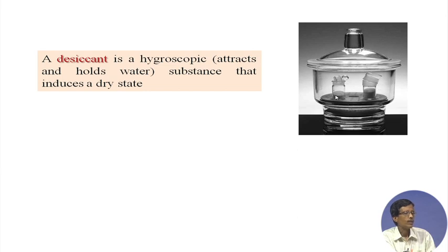So, this is the solid sample, you consider that you can have potassium dichromate within it, and another one is oxalic acid, and you see that this cover has been opened. This cover is also opened up, because the inside of this weighing bottle should be in the environment of this desiccator. This particular container we call a desiccator, where we put some desiccant such that the environment within this unit is dry and moisture free.